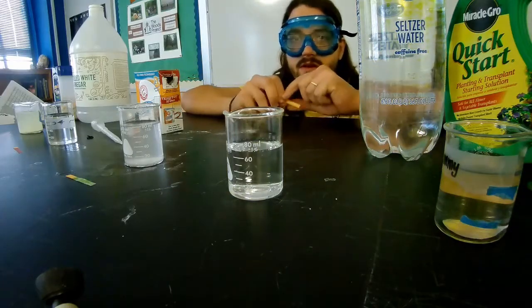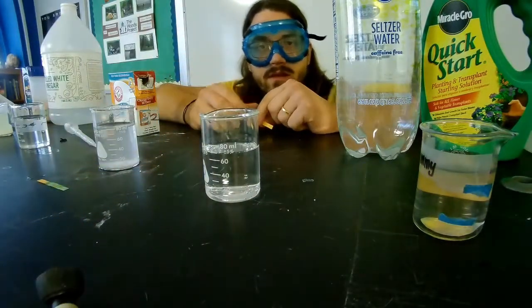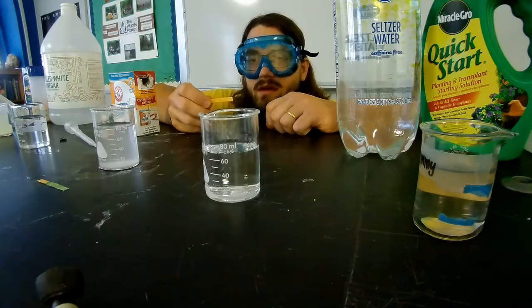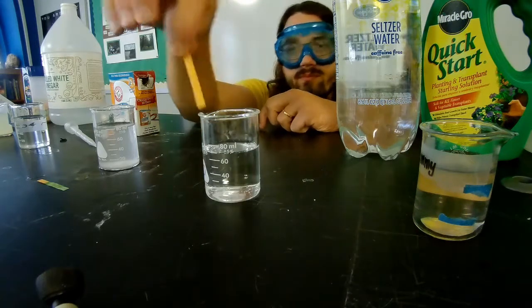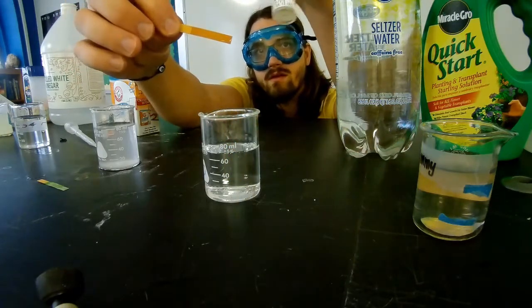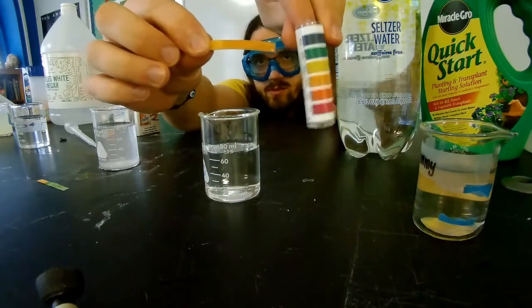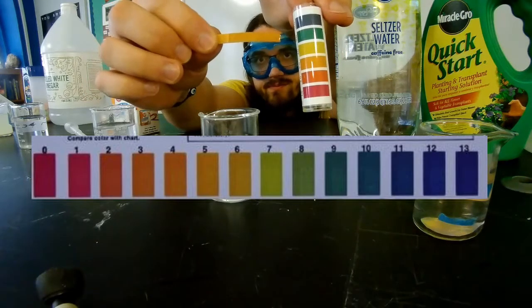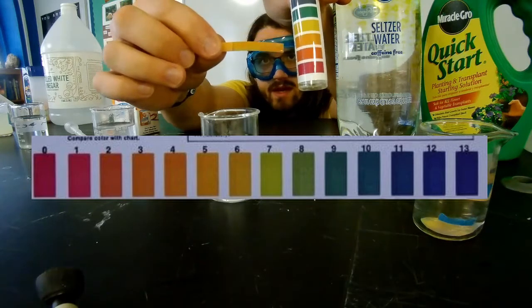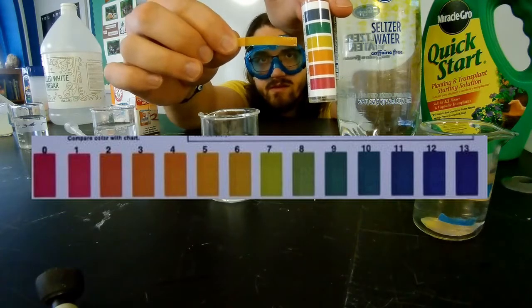All right, let's move on to our next chemical here. This is going to be our carbonated water. And let's see what happens. Well, there's our initial result there. I'll let you be the judge of the color change there. Not too much. What do we think? An acid or a base? And what is the pH?